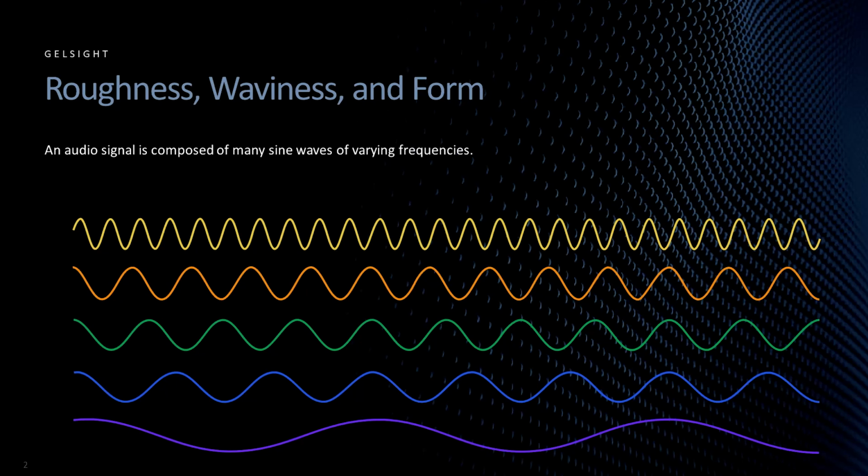All signals, whether they be audio signals or measured profiles, can be analyzed for their wavelength content. Every signal is composed of sine waves of various wavelengths that can be separated or even combined again to recreate the original signal.